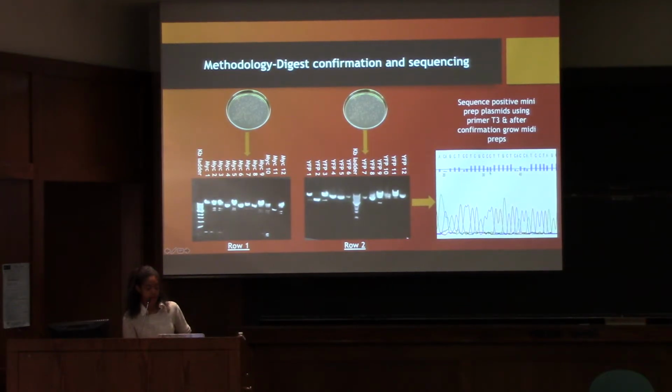And here's an image of this sequencing, and we checked the alignment because we know the specific genome of YFP and MYC, so we tested it against each other to see if it matches up. So if the alignment was correct, we could move on.